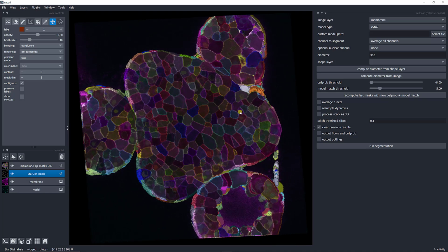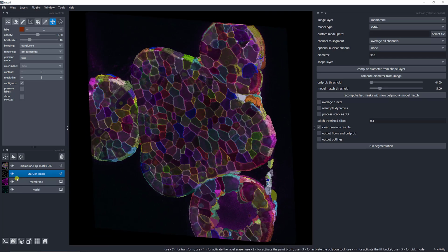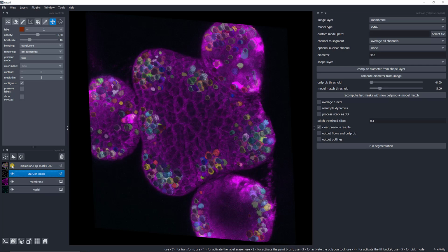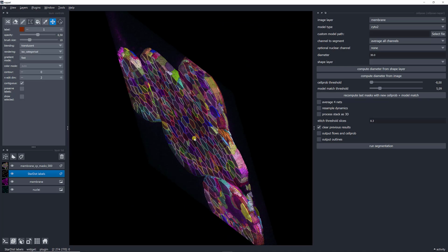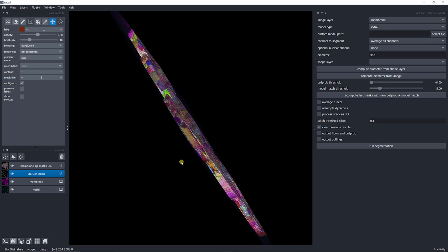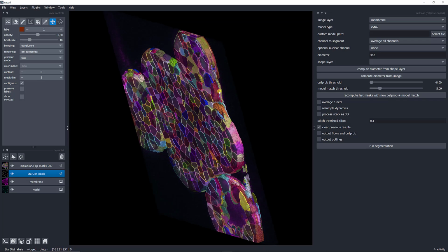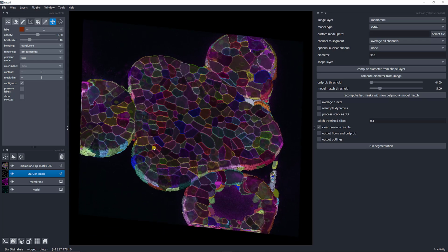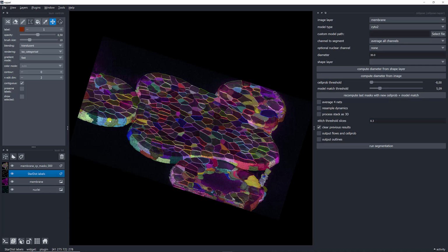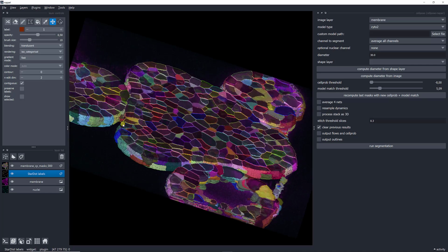We do some mistakes. I pushed the labels, so the parameters. Let me check. Yes, here you see it's probably just background, and it found some cells. But again, I pushed the labels. So one common problem here, it's not that thick, so we might not see that deep. But again, the parameters were pushed too far. So here we probably don't see it much, but if I did it on the whole plane, we would definitely see it. So here, I can probably see something. Let me check if I can navigate.